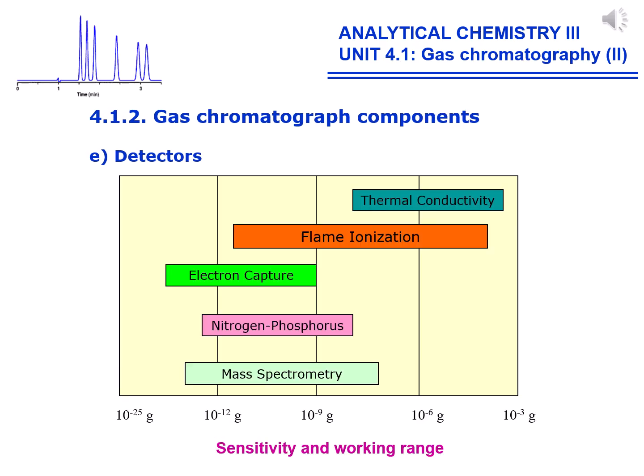There are several gas chromatography detectors, covering a wide concentration range, from milligrams to picograms. Of all of them, 5 have been selected as the most widely used today, and are summarized in this graphic. They are presented based on their sensitivity. We are going to discuss each of them separately to explain the basic principle of operation.